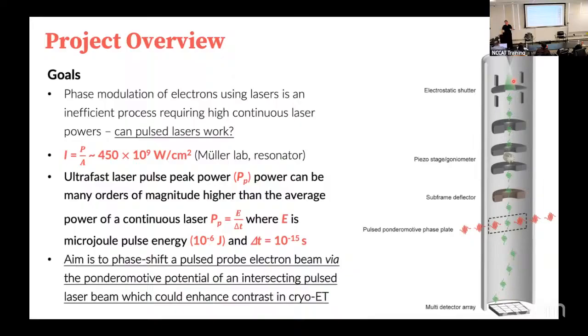And so one of the people that I worked for wanted to be able to do periodic release of electrons, like a lighthouse. So you basically have very periodic single electrons coming off the tip. And so what we would do is generate single electron packets that would come down the column. So now you're not doing just random. Now you're timing it so that you have single electrons coming down.